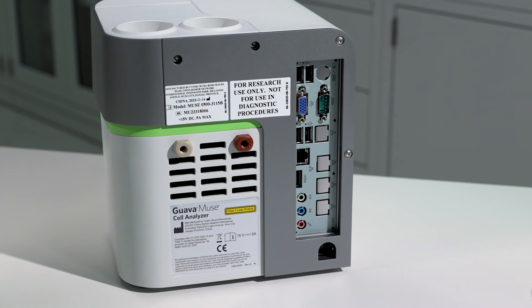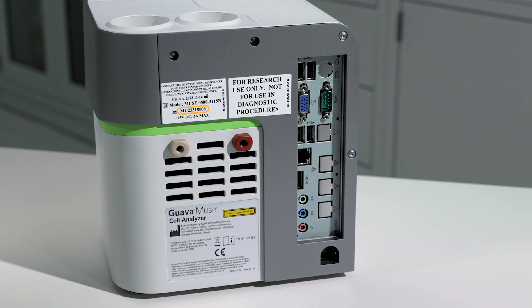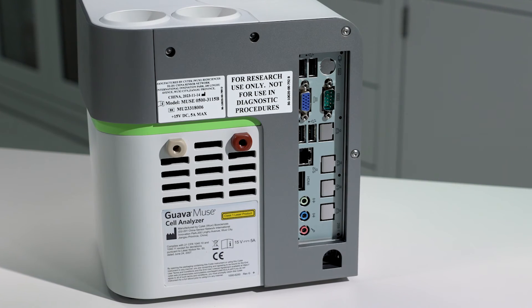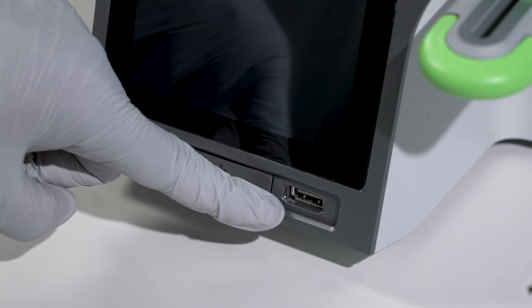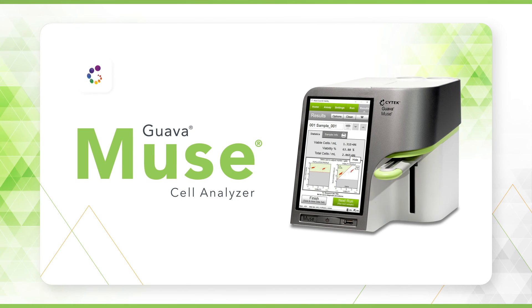The serial number of the instrument is located on the back of the instrument near the top. You will need this number when you register your instrument. There are a total of five USB ports on the Guava Muse for data transfer — four are located on the rear of the instrument and one is at the front near the on button. You are now ready to complete installation. Before proceeding to the next step, please take a moment to register your instrument. This important step takes only a few minutes and will ensure you receive critical firmware and software updates for all new applications released. You will need to provide the serial number and fill in the required fields.